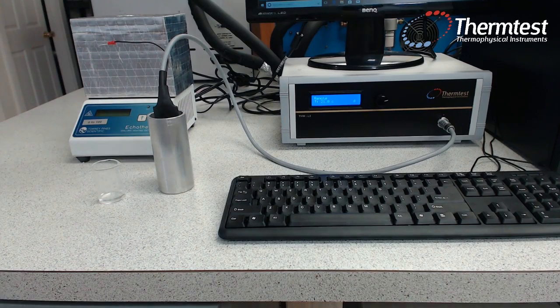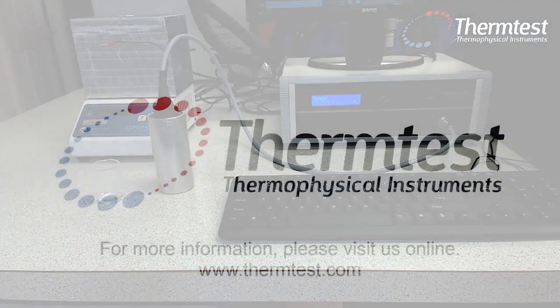So that concludes our example measurement on liquid.